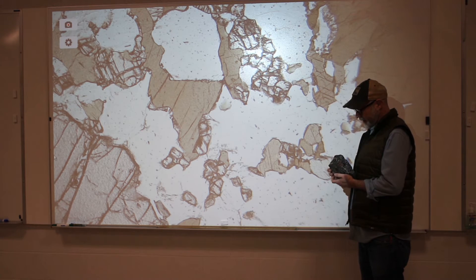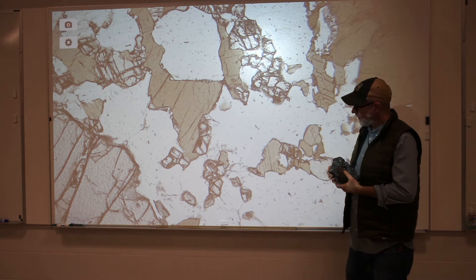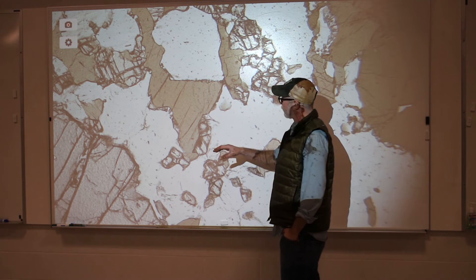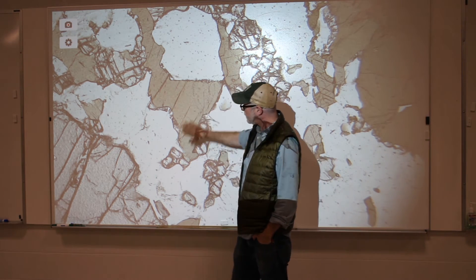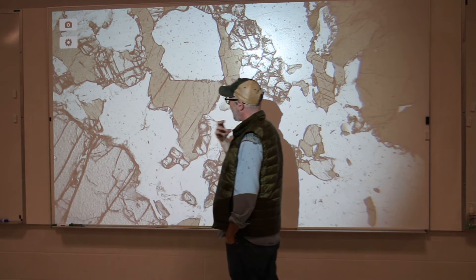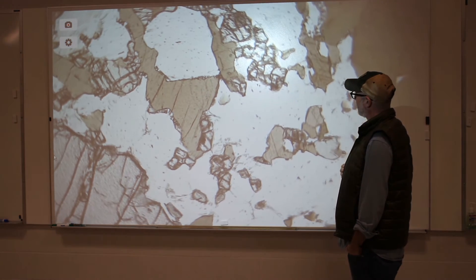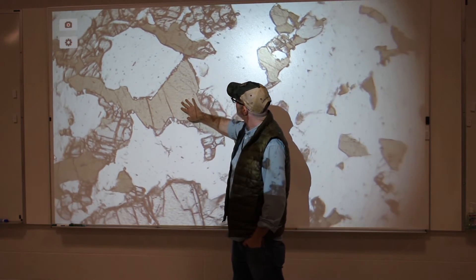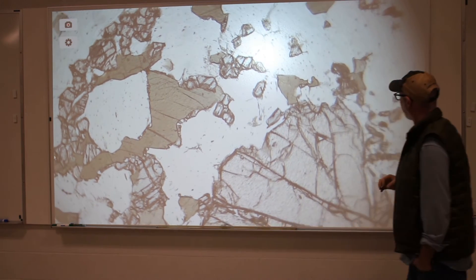Now we're looking at a thin section of the Gore Mountain rock — the one with the large garnets we looked at downstairs, plus some smaller garnets as well. Here you can see we have minerals that are showing a little bit of color in the thin section, and some that don't but still stand out to your eye — they have what we call high relief. As you rotate the stage you'll notice a little bit of color change, not much, in the brownish minerals.